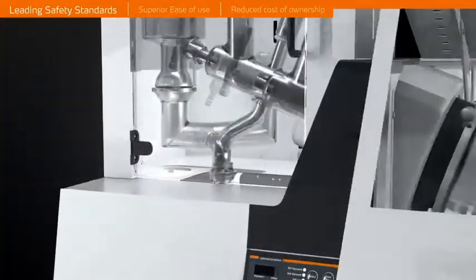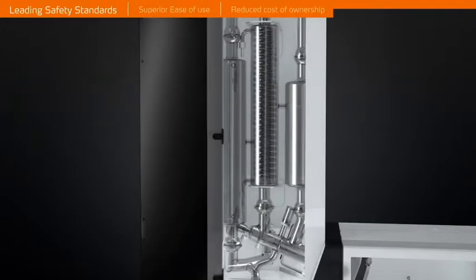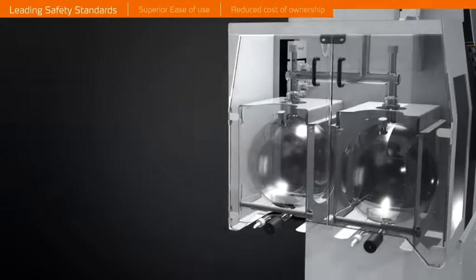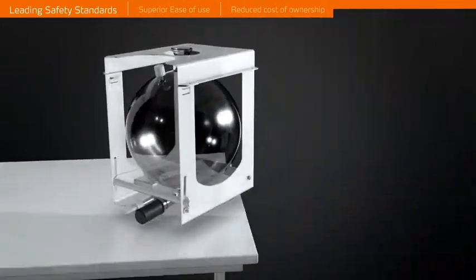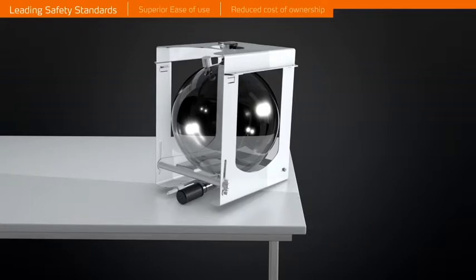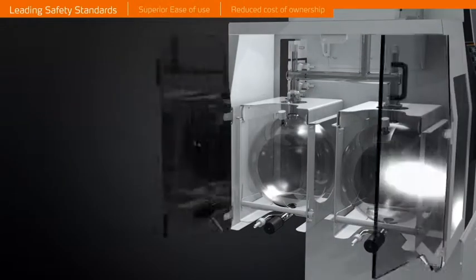All available glassware assemblies are contained inside a metal housing with a transparent high-impact PMMA door to provide industry-leading safety standards. The receiving cassette system protects glassware and offers a unique self-standing support. High-impact PMMA doors give additional operator safety.